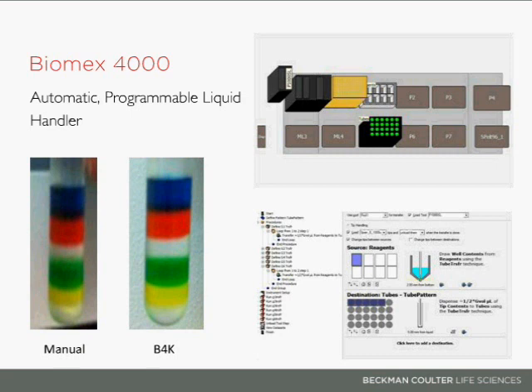We saw there was no difference. When we ran them on the centrifuge, there was no difference. The only difference is I wasn't struggling for hours at a time to prepare this density gradient. We could just set it up in the machine, about 12 minutes per tube. You walk away, do other work.